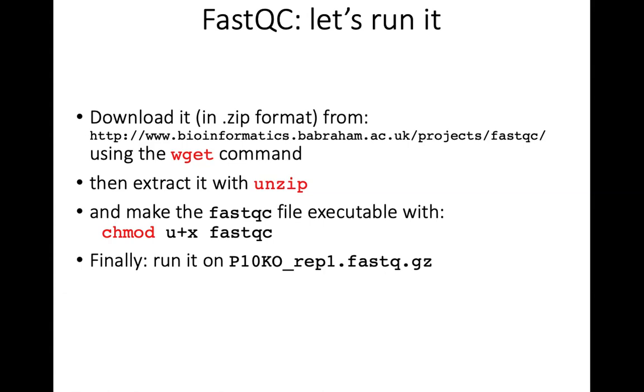In this case, just go to the Java website. When you use Java for FastQC, you might need it, and generally, if you're going to run some software, it's a good idea to have Java installed. It's just the same file; the archive format is different, so the contents are the same. Then you should have the file on the laptop, and then you can upload the file to the project and then install it.